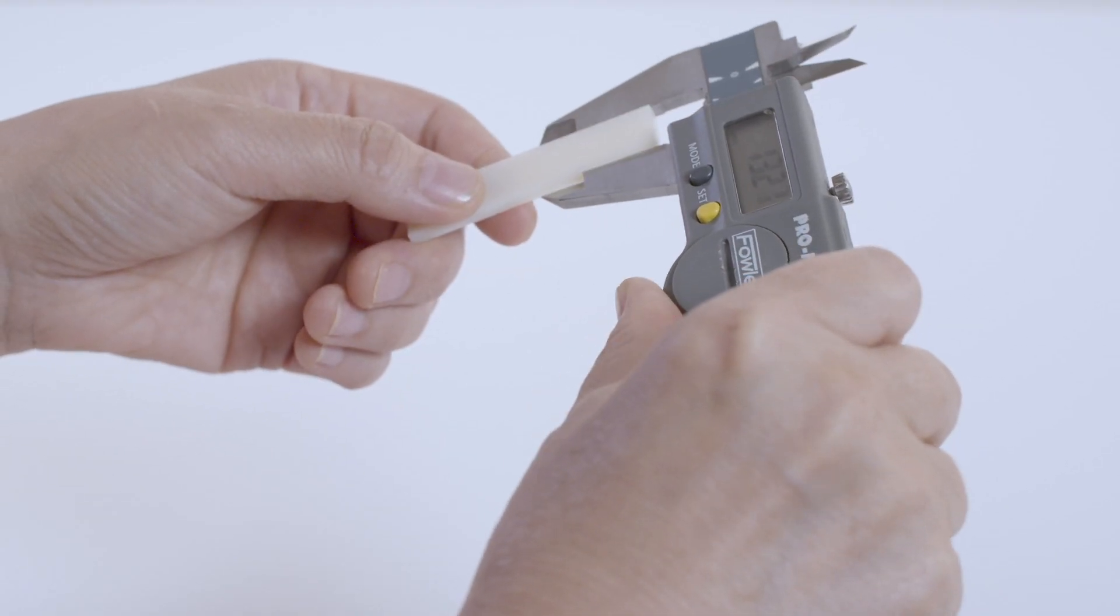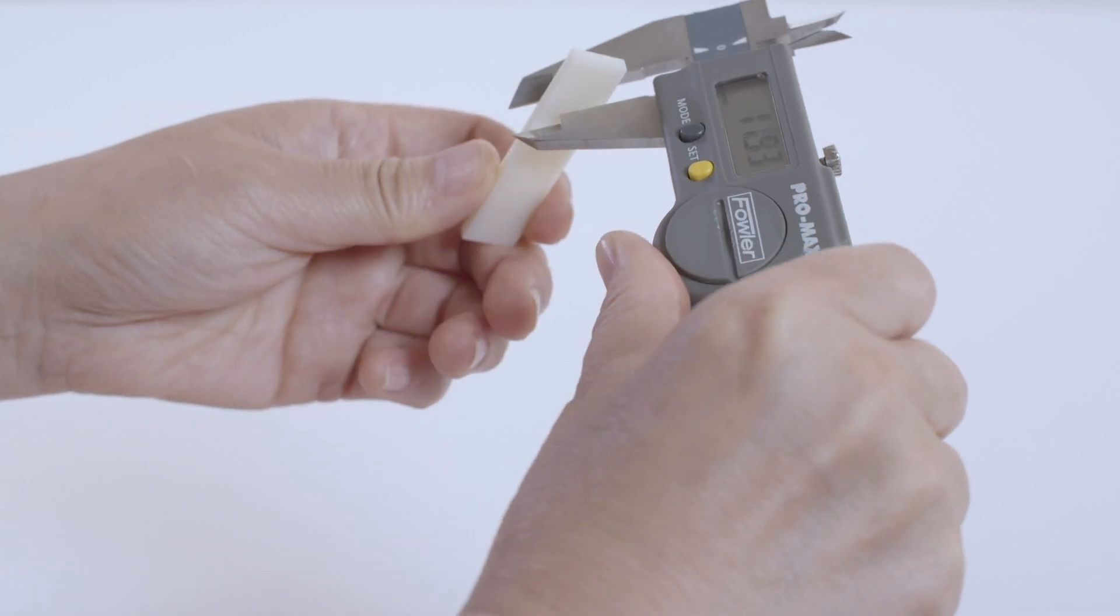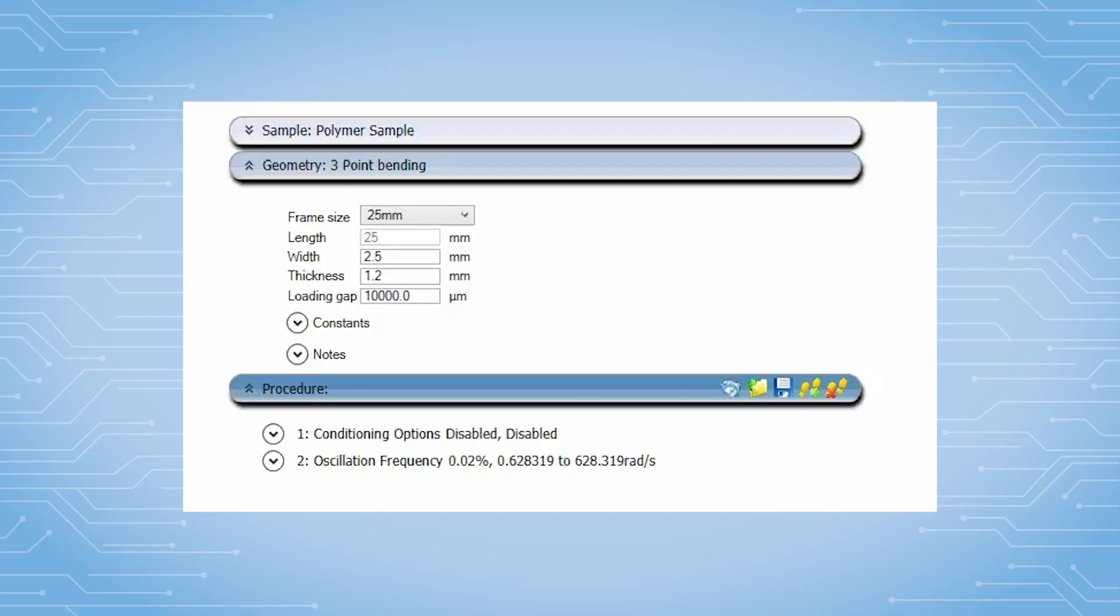Use a caliper to measure the sample width and thickness. Enter the sample dimension into the geometry file in TRIO. The sample length is the span of the bottom frame.